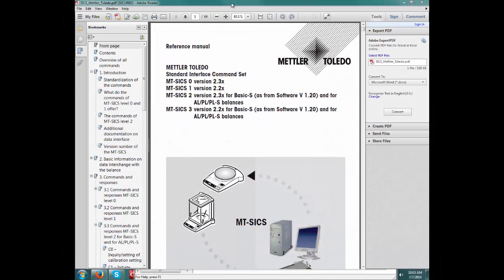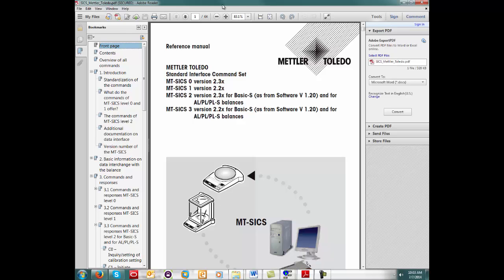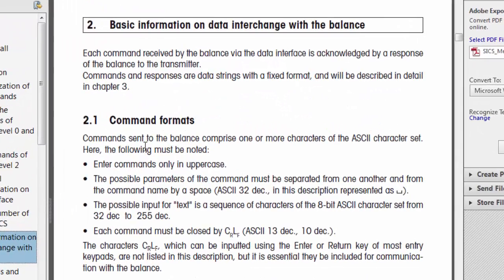I'll start by bringing up the SICS protocol document, which you can see here on the screen. We'll take a look at the syntax required for the command and the response that I'm going to show you today. First, let's take a look at the basic information on communication with the scale so that we can find a few useful details.